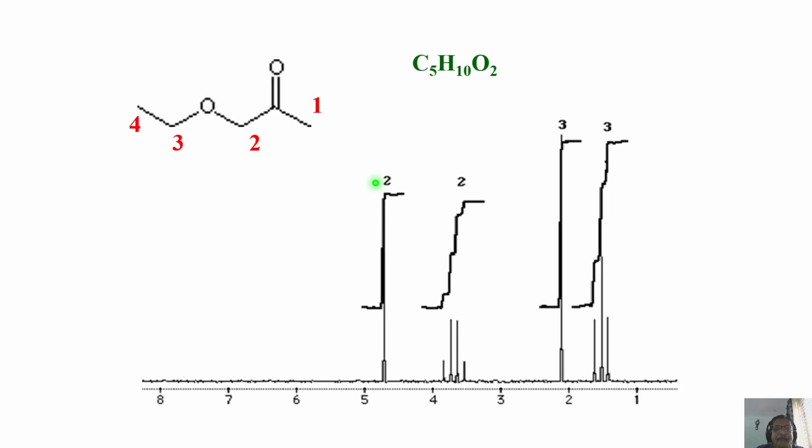Very interesting again. What is happening here? This is a terminal CH3 here, and it is coupled to the CH2 here. As a consequence, this is a triplet and this CH2 is a quartet. So the intensity ratio also perfectly agrees.